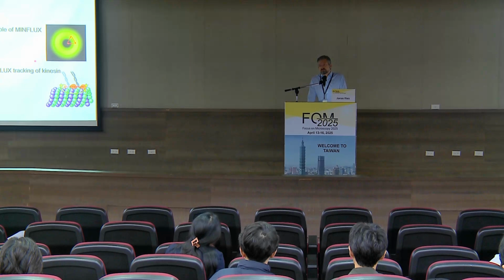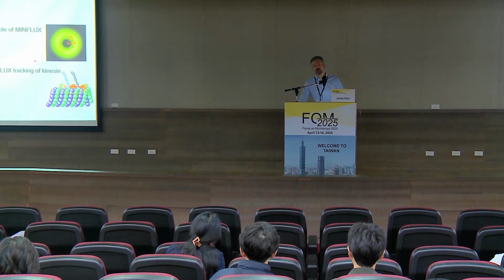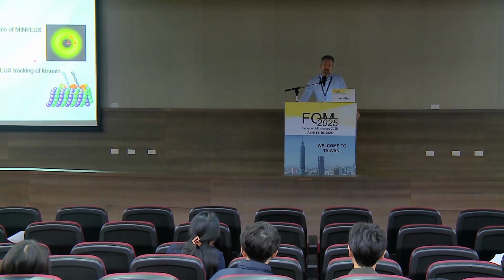Or you try different labeling approaches, not DNA-PAINT, but if you genetically fuse a protein, then there is not much unspecific binding that can happen. But of course, the photon numbers are much less. Yeah, but we struggle with the same, and it's always about doing the proper controls, trying different blocking agents, trying different things, even in fixed cells when we do imaging, to reduce the background.